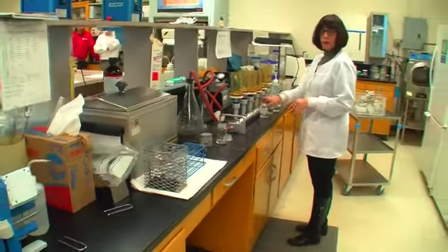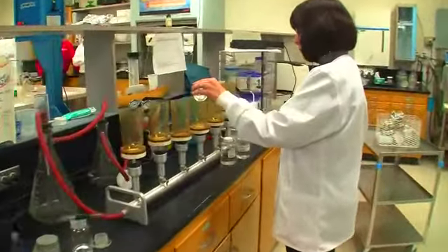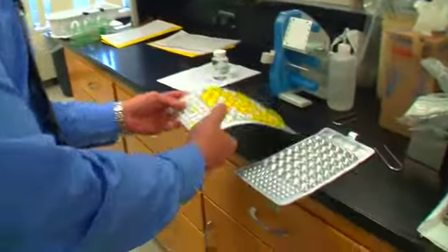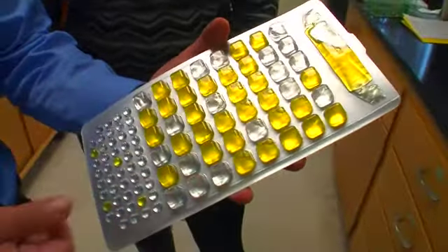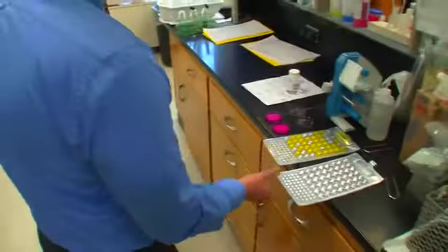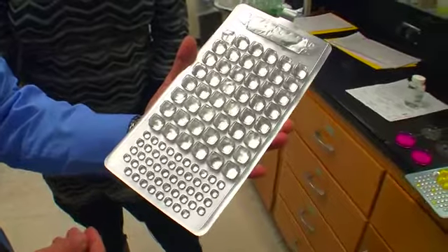Here, Cindy Klein, one of our lab technicians, is going to process some samples, and this is filtering them. They'll be incubated, and then we'll check them 24 hours later for any bacterial growth. There are several methods that the lab is certified to perform when doing BACT testing or microbiological testing. Here's an example of a positive bacteria sample. It has a yellow color that indicates that there's bacteria in the sample. This is from our raw source water before any treatment process. Over here next to this, we have a negative sample from the distribution system. This is what we want to see every day that's going through people's taps.